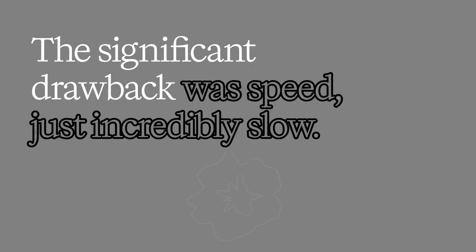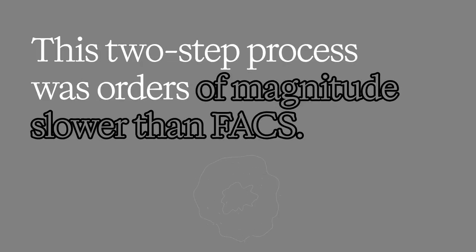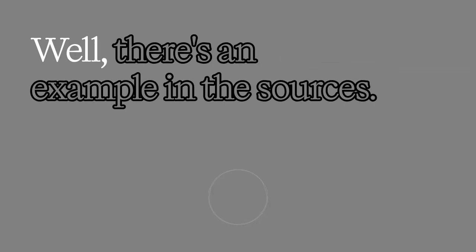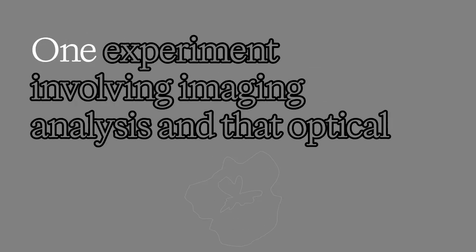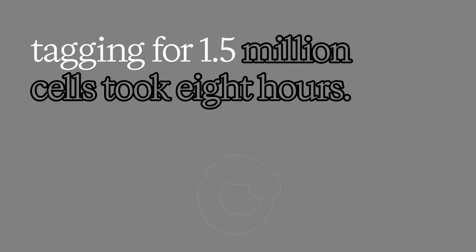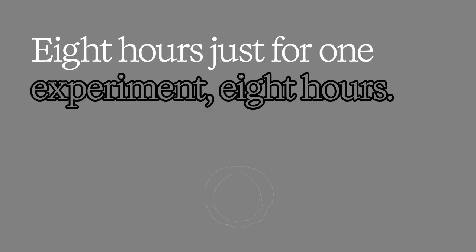The significant drawback was speed, just incredibly slow. This two-step process was orders of magnitude slower than FACS. Really? How slow are we talking? Well, there's an example in the sources, one experiment involving imaging, analysis, and that optical tagging for 1.5 million cells. Took 8 hours. 8 hours just for one experiment.